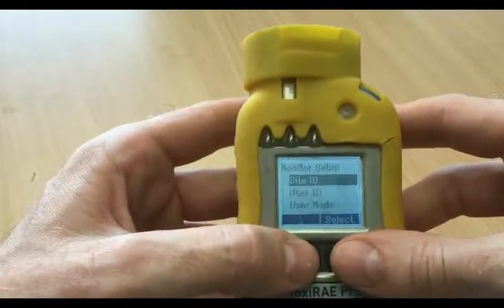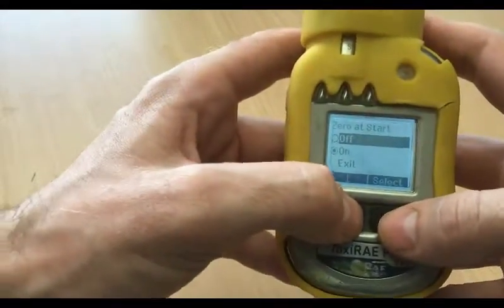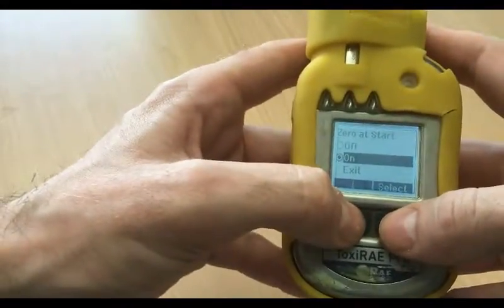Other than that, that's pretty much it. Another point to check: make sure zero at start is on, just so you're getting those zero readings.